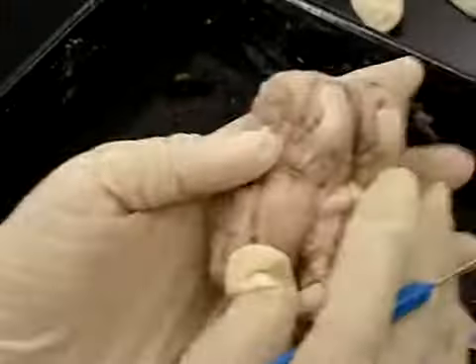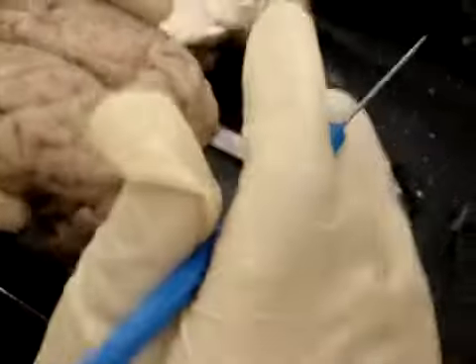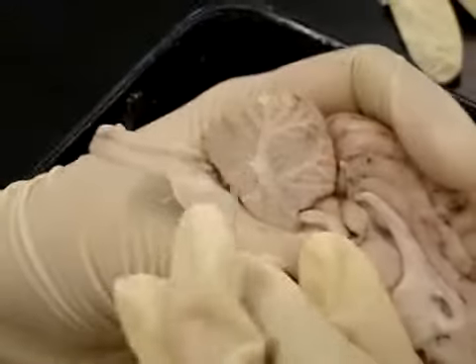Subdural space, you can't really see it on the brain. Subdural is below the dura mater, subarachnoid is underneath, between the arachnoid and above the pia mater. Gray matter is basically the outer covering of the brain. If you want to look at half of a brain, this is actually gray matter. You can tell the color difference: white matter, grayish, gray matter.